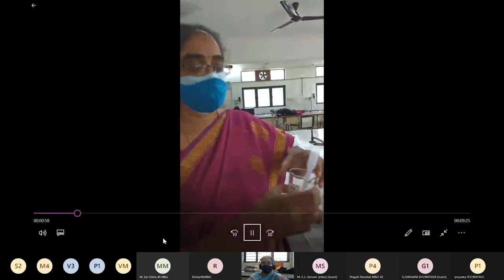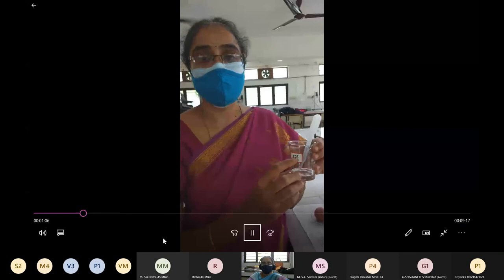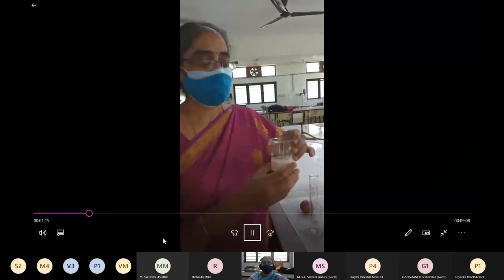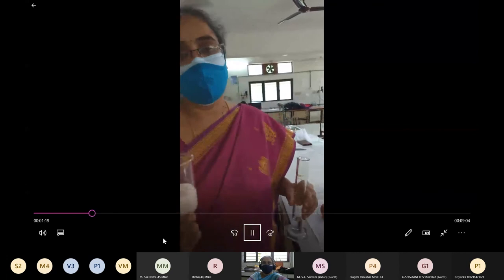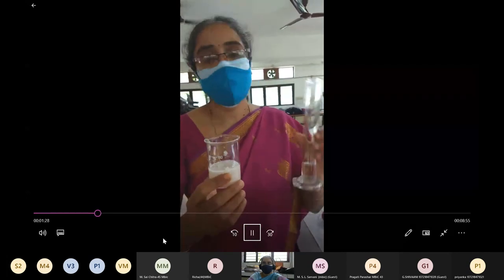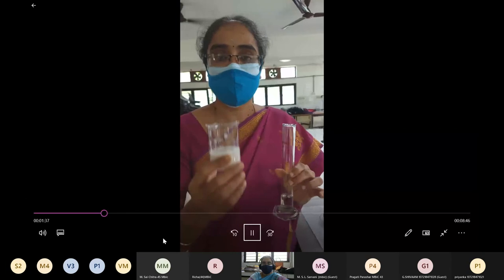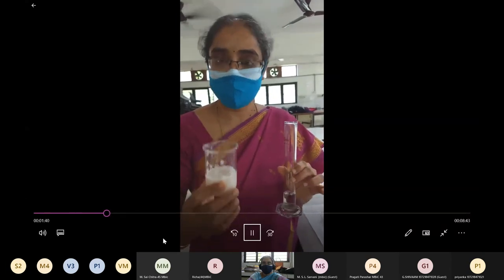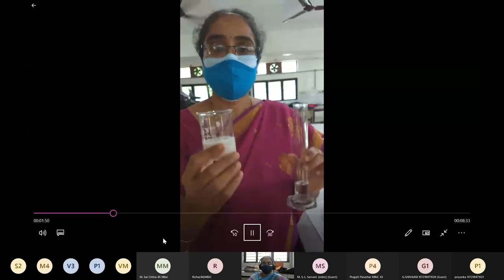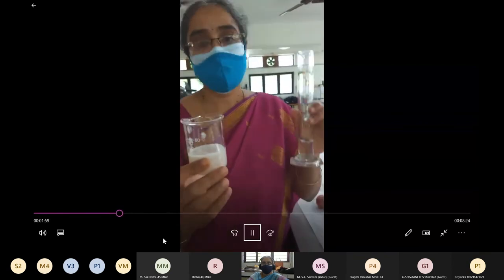The next component required for extraction is SDS, sodium dodecyl sulfate, which is a detergent acting as an emulsifying agent. Cell membranes containing lipids and proteins will undergo emulsification, allowing the precipitation of the DNA molecule. For a full medium-sized onion, use 50 ml of lysis buffer; today, using half an onion, 25 ml of buffer was taken. Peel the onion skin, dice it into small pieces, and place in a mechanical blender or use a mortar and pestle, adding the measured lysis buffer little by little while grinding to get the extract.